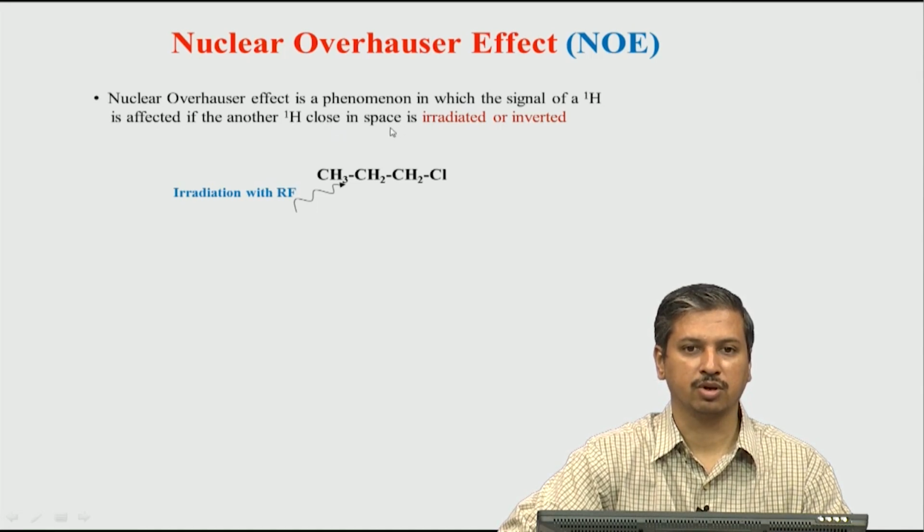Okay. Now, it is not just the presence of two hydrogens nearby that results in NOE. What happens is you first have to irradiate one hydrogen. The irradiation of that hydrogen disturbs the population level in that particular hydrogen. We saw that when you do not apply a pulse, that is the Boltzmann distribution of population at equilibrium, but when you apply a pulse the populations become equal.